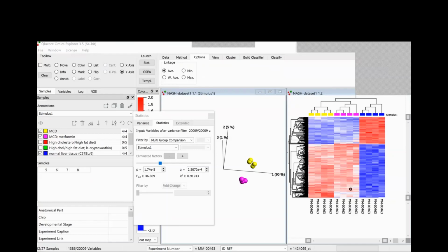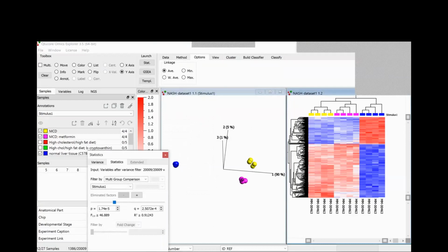So the treatment means that these subjects are becoming more normal. And we see the same tendency here on a couple of genes. And you can maybe see that also in the PCA plot, that the pink group goes towards the blue group a little bit. It's not a very strong signal, but still you see the tendency.